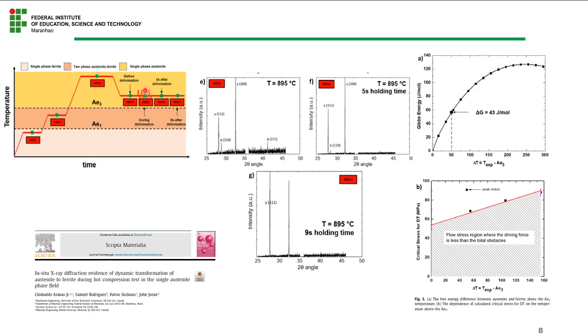And here inside the middle of the compression test we measured, and here we also measured after the application of the compression, at the holding time at the temperature where the compression tests were applied.